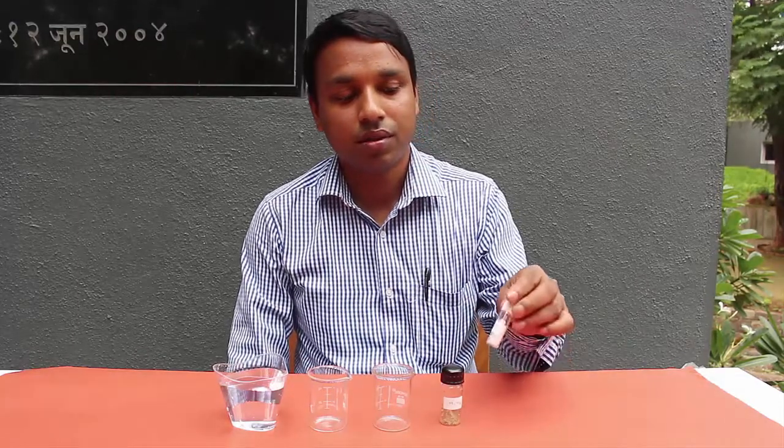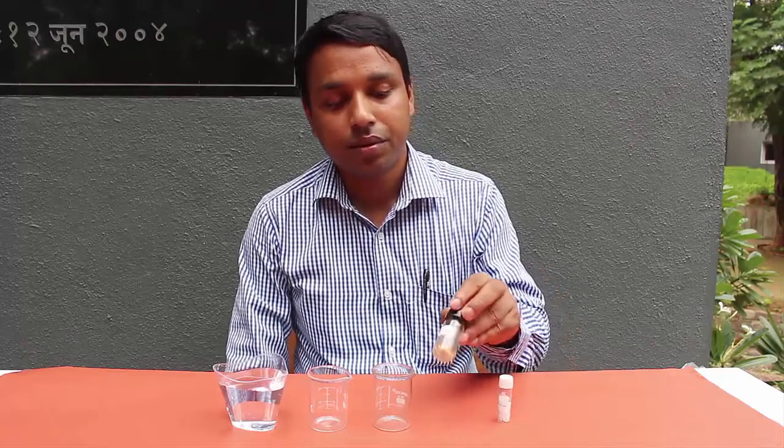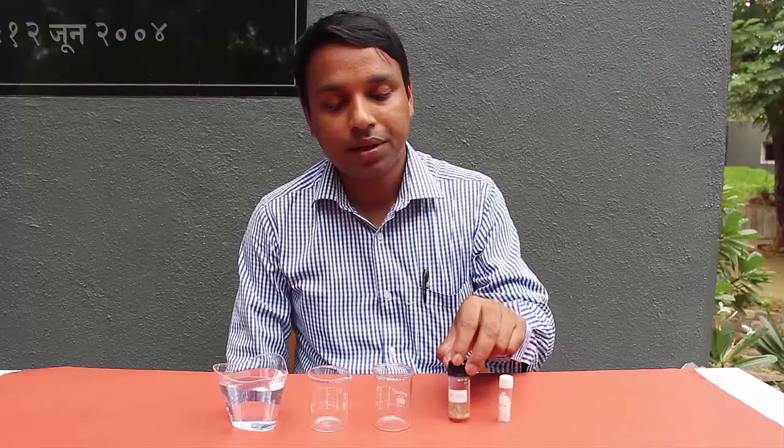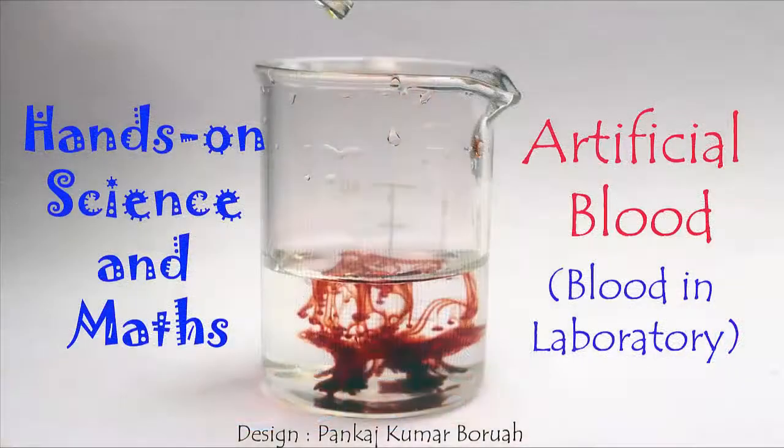In today's chemistry experiment we will produce artificial blood, or something looking like blood. For this amazing chemical reaction we will need two chemicals: ammonium thiocyanate and ferric nitrate. We will also need two empty beakers and a glass full of water.